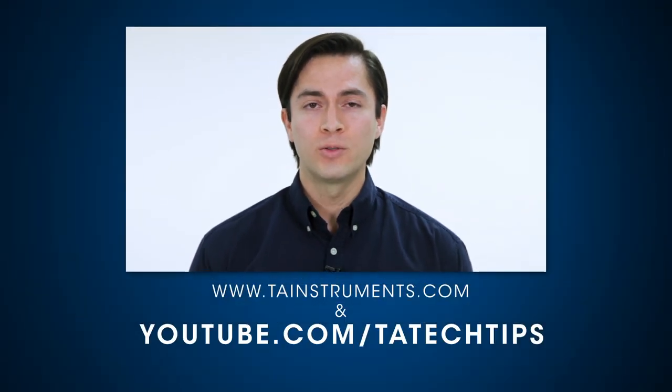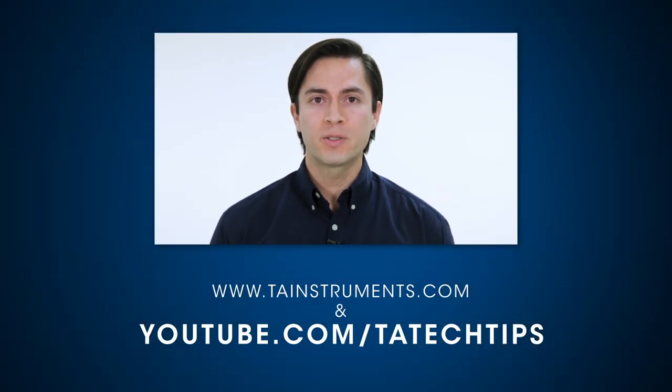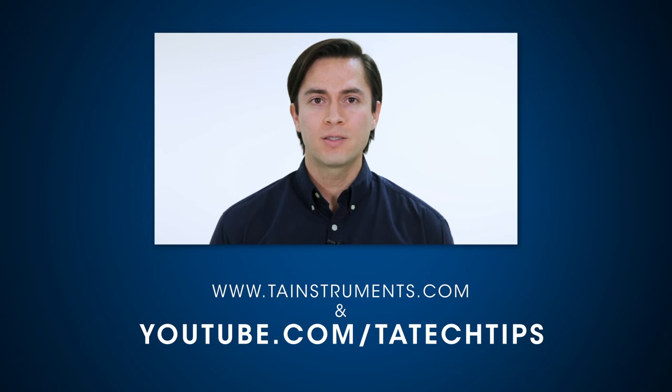In this tech tip, we reviewed how to use the specimen insertion utility in WinTest DMA software version 8. Please stay tuned for more useful tips from TA Instruments and thank you for your interest.